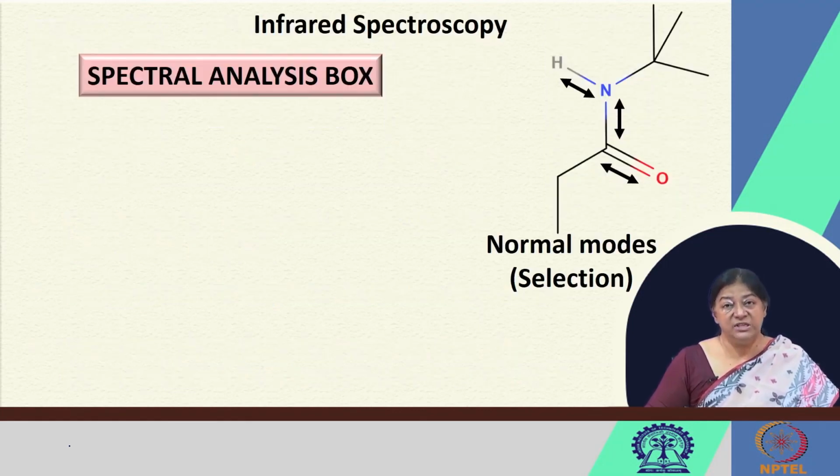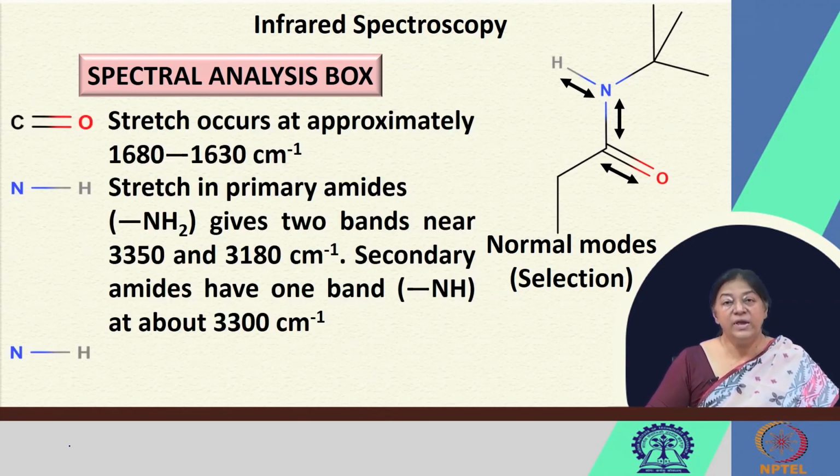If we look at infrared spectroscopy, each of the spectroscopic methods that we are briefly touching upon here will be shown in their specific aspects as and when we study specific techniques and specific ideas related to the topic at hand. When we are looking at infrared spectroscopy, we have normal modes and what are called stretching and bending of these bonds.